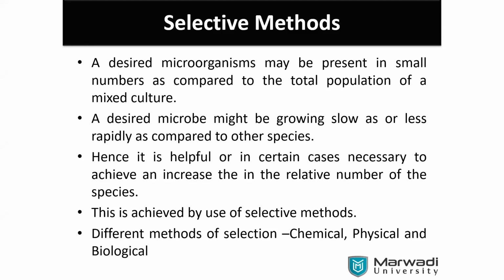Purple, red, yes we have seen the red, yellow, some black, some orange, four or five colors. If you are going with a microbial culture from the soil sample, then you will get some pink color, some reddish green, so many colors, violet, blue. So color as well as texture, all the characteristics you can observe over it.